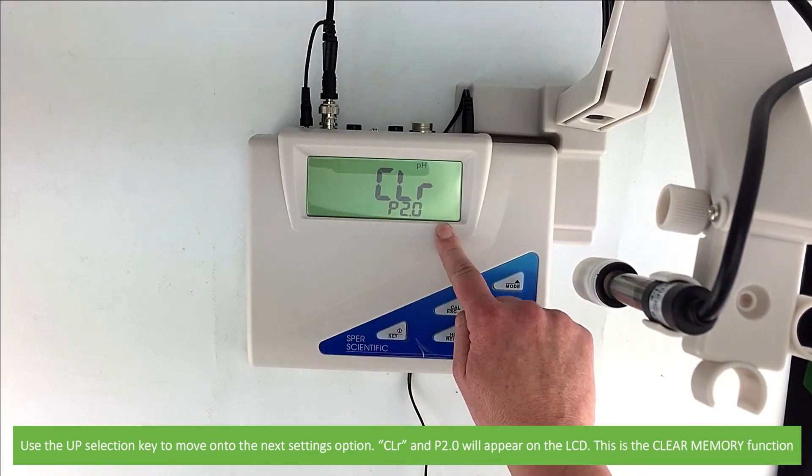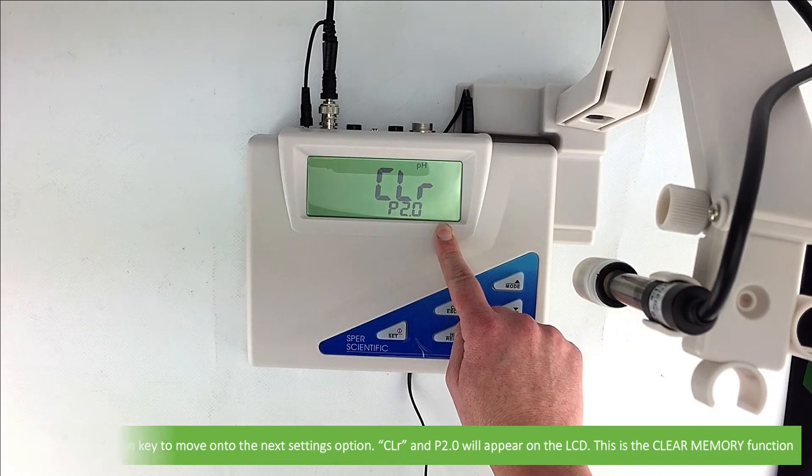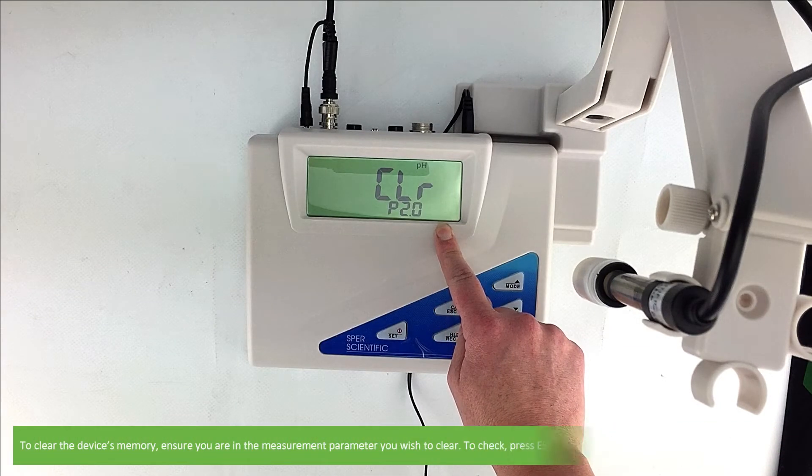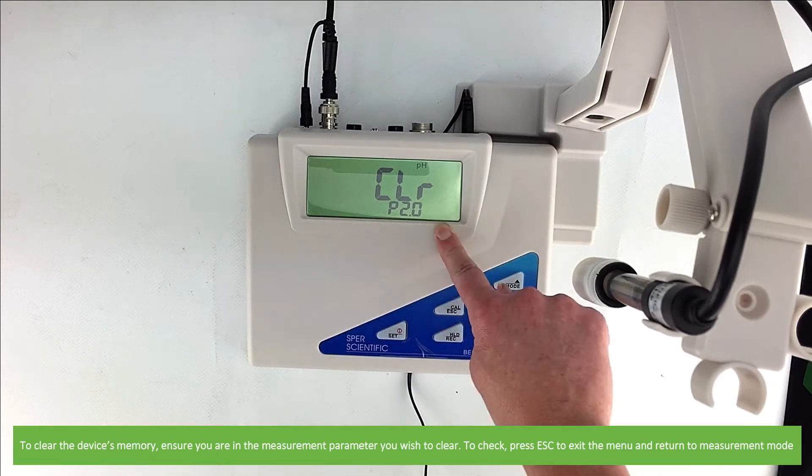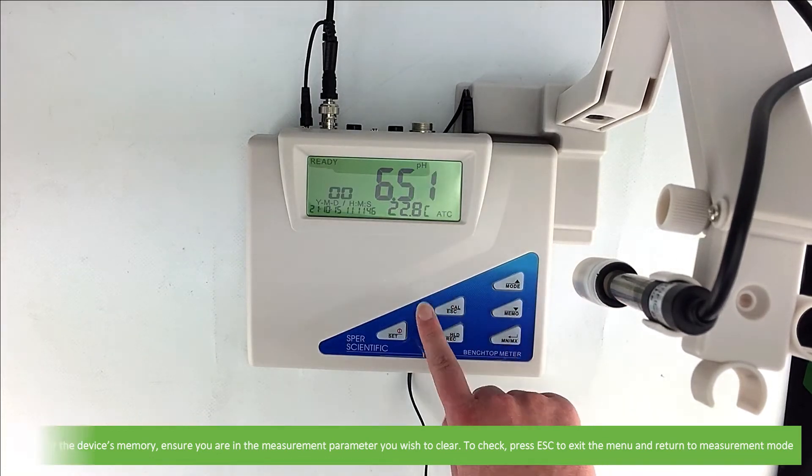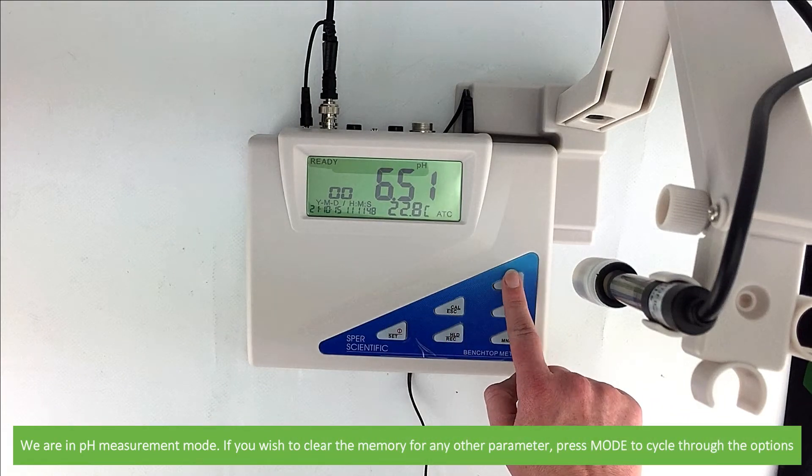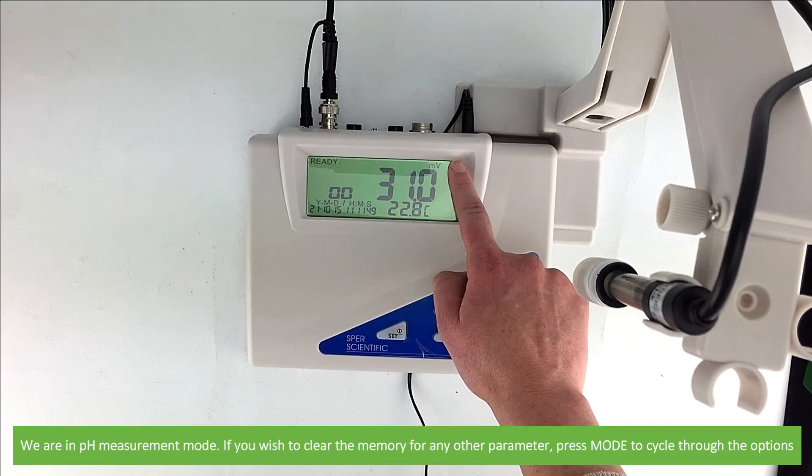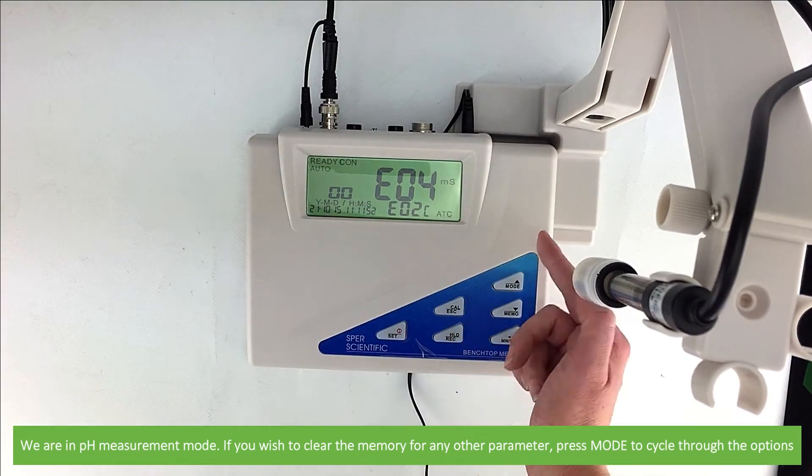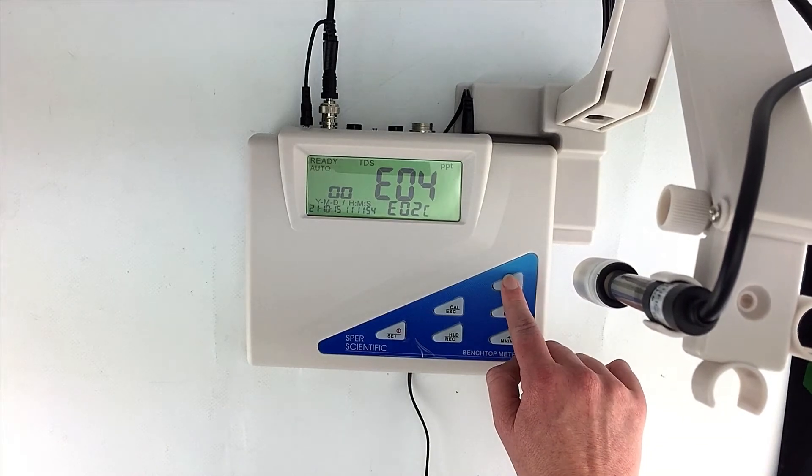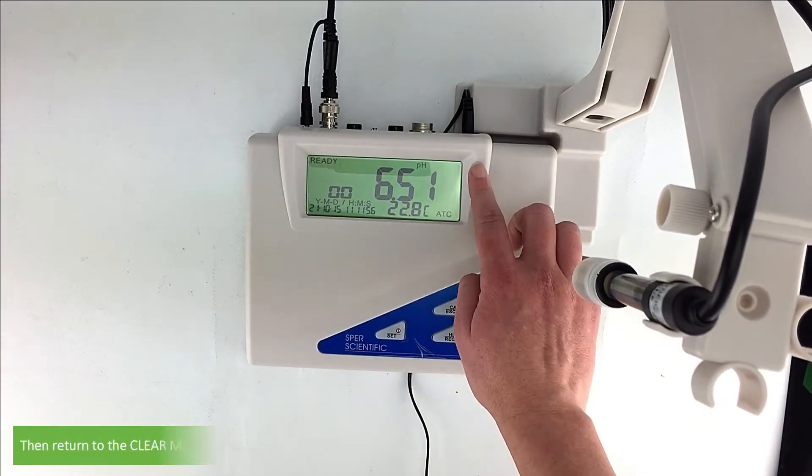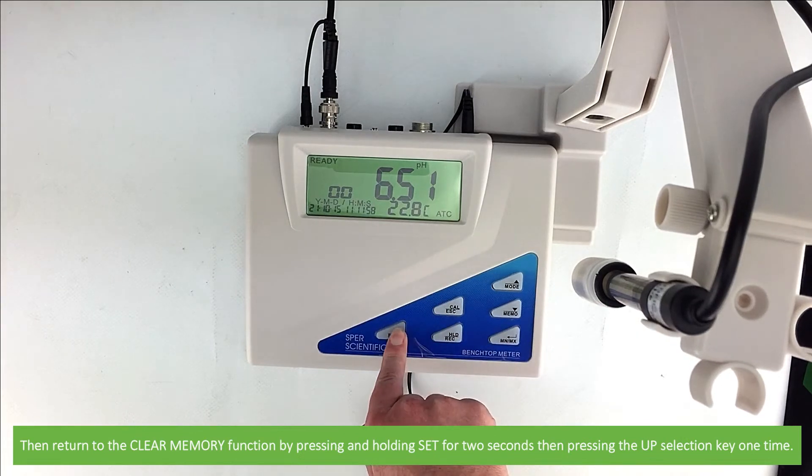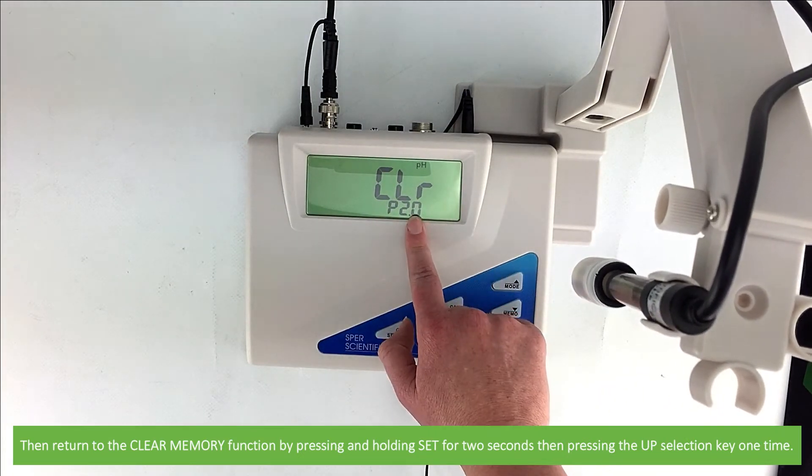CLR and P 2.0 will appear on the LCD. This is the clear memory function. To clear the device's memory ensure that you are in the measurement parameter you wish to clear. To check press escape to exit the menu and return to measurement mode. As you can see we're in pH measurement mode. If you wish to clear the memory for any other parameter press mode to cycle through the options. Then return to the clear memory function by pressing and holding set for two seconds and pressing the up selection one time.